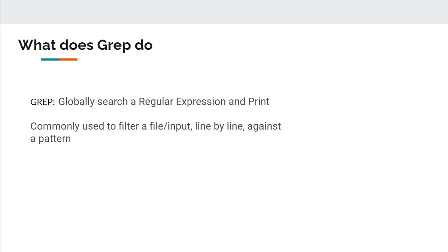So what does GREP do? GREP stands for globally search a regular expression and print it. That is the full form of GREP. So basically it is commonly used to filter a file or any input. It will parse and loop over line by line and check whether the given pattern is present or not, and if it is present it will print that line. So that is where it is used to filter.